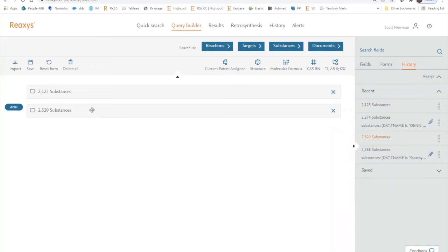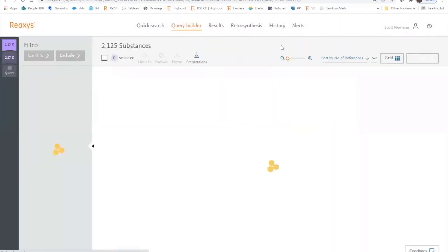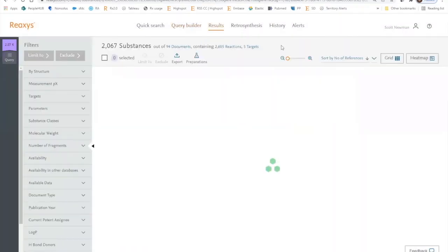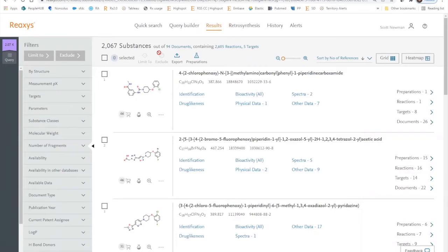So now we're going to identify those substances that are common to both SCD1 and SCD5 inhibition using the Boolean operator and performing a substance search. We identify 2,067 substances, which we can now view in the heat map.